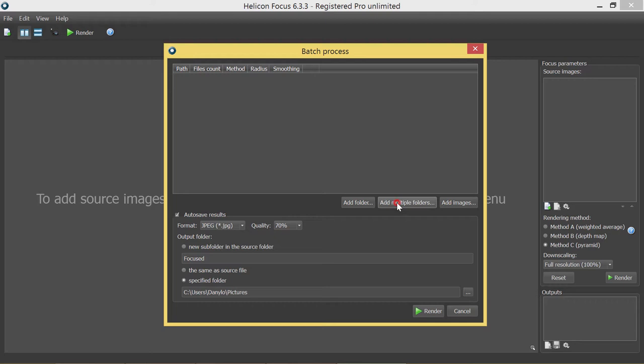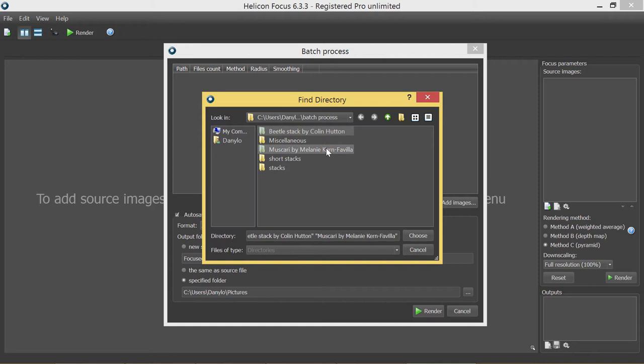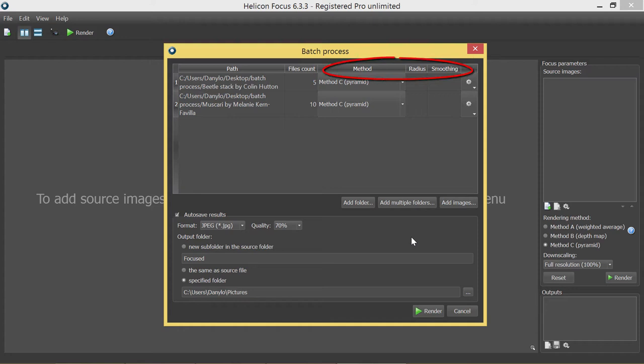Once the stacks are added to the queue, you can see the number of files in each of them and set the rendering methods and parameters. In the autosave results panel in the bottom part of the dialog window, you can set the output format and choose the target folder.